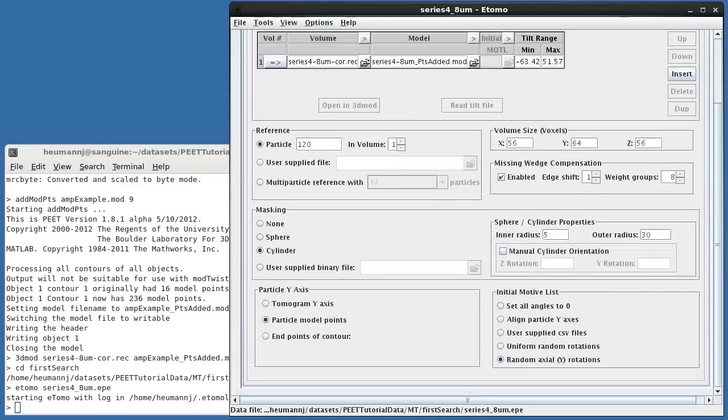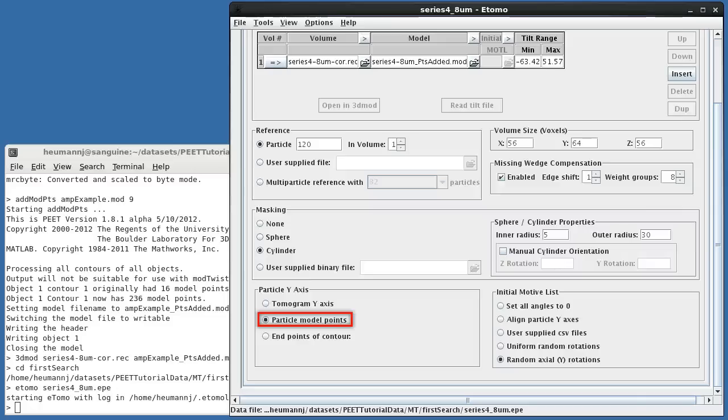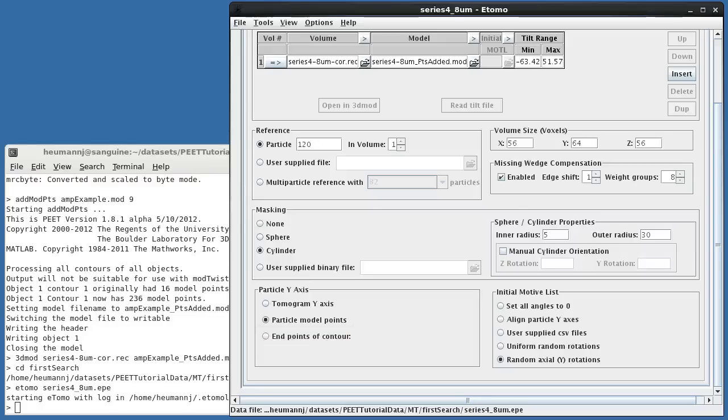Because the microtubule has a defined axis, I've selected Particle Model Points for the particle y-axis. This means that the y-axis will be defined locally for each particle as the vector between neighboring model points. Given that this microtubule is quite straight, I could also have selected Endpoints of Contour, which would use the same y-axis for all the points in a contour.